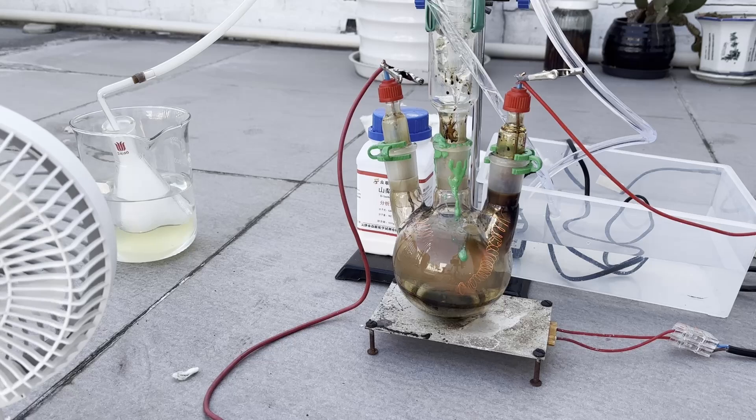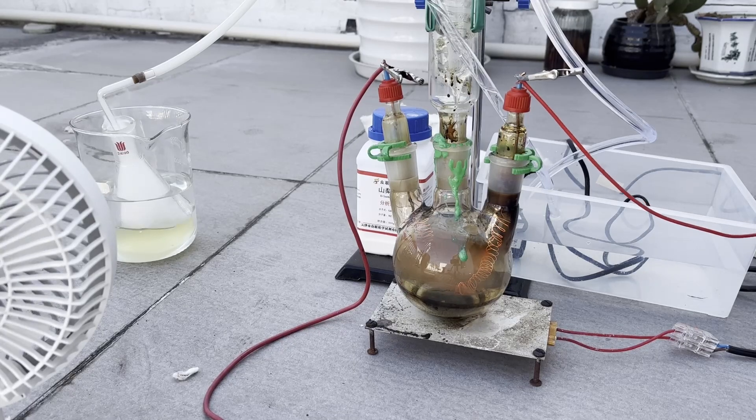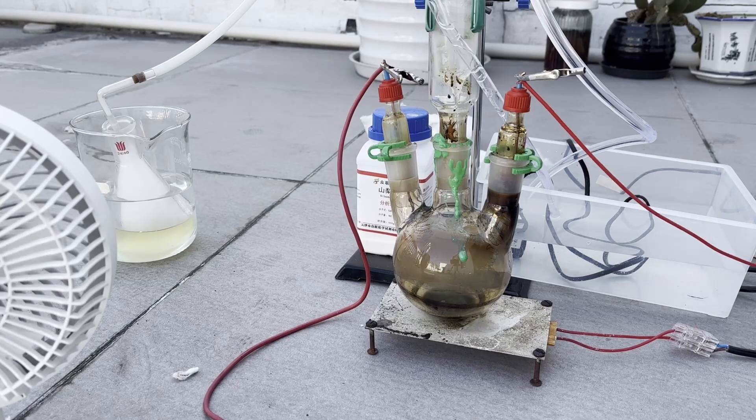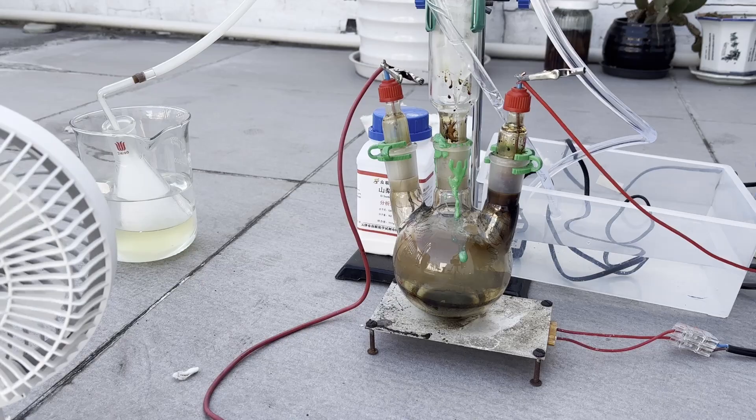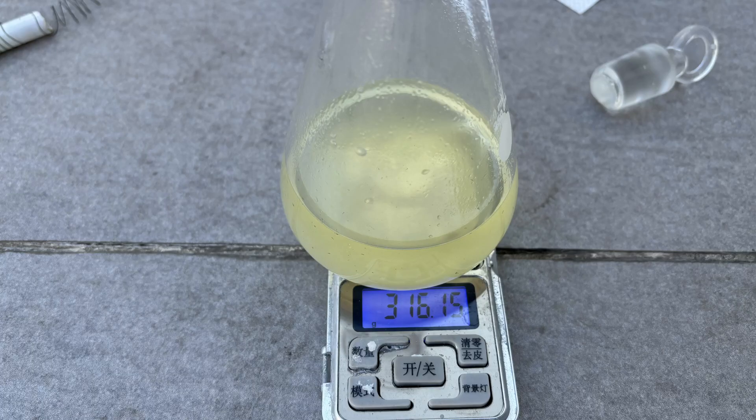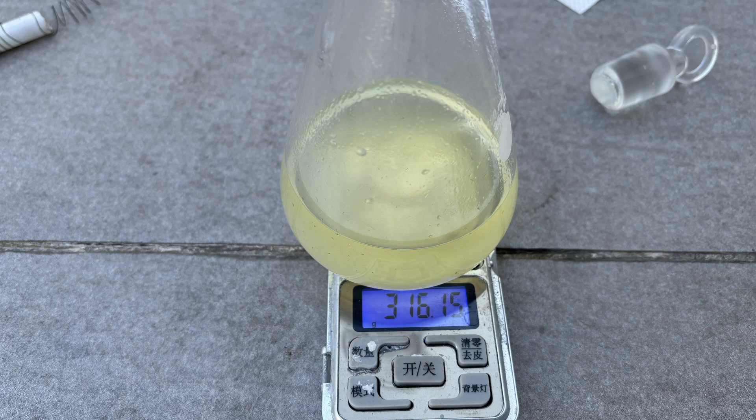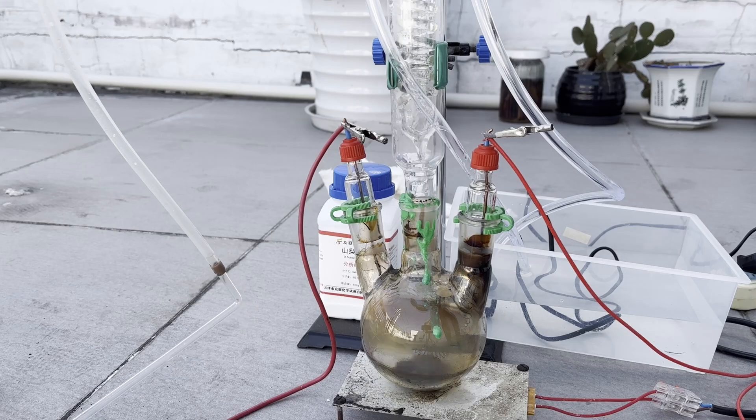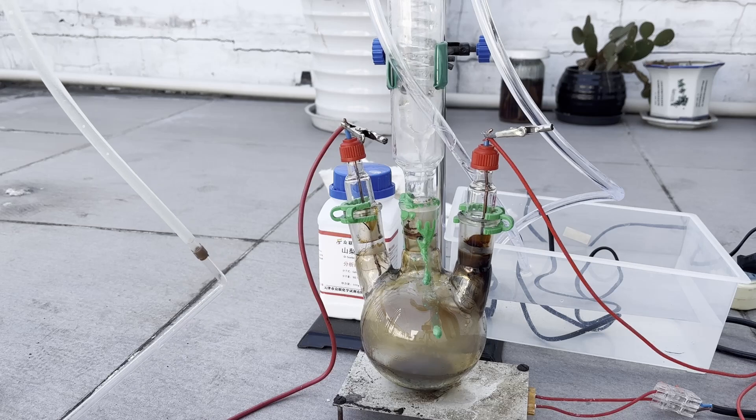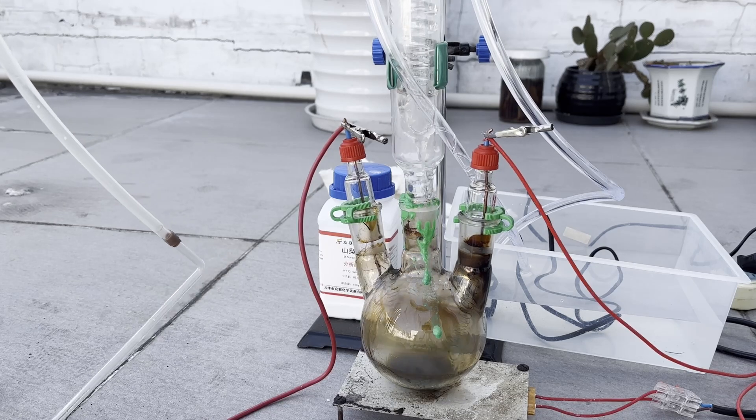After around 50 minutes, the acetone is nearly depleted and a lot of tar formed in the flask, so I turn off the filament and allow everything to cool. The total mass of the conical flask and its contents is now 316 grams, which means that it has gained 40 grams of weight, but a large portion of this is just acetone and not ketene. So I decided to add some more acetone to the lamp and run it for a bit longer.